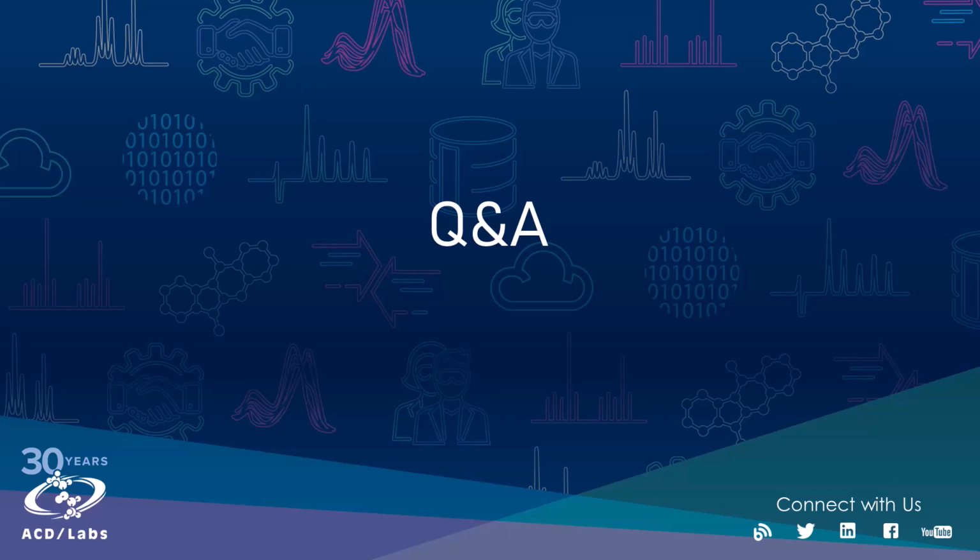If you're using an online mode that's interacting with your CDS, then partway through the training, you'll be acquiring data, and then you'll process it together with the application scientist. In addition to this, we have very detailed training manuals. There are, I think, a quick start guide and a video that can also help.